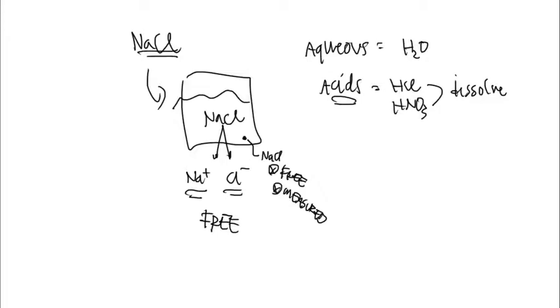If you just use water for those, well, a lot of it's going to be broken up maybe, but there's going to be a significant portion that will stay together and it will not be broken up. And that's why they're telling you to use acid instead, because they have to ensure that everything is freed. All right, now there's a process that this goes through as far as your sample is concerned, and we call this atomization.